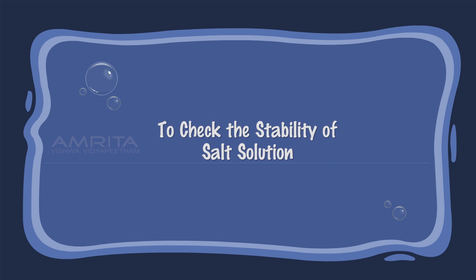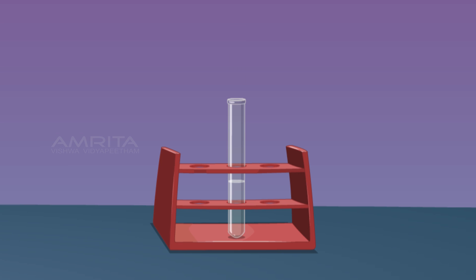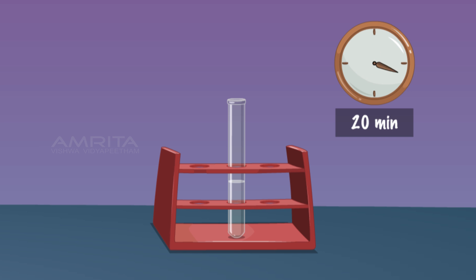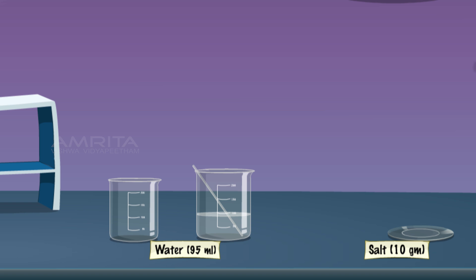To check the stability of the salt solution, take some salt solution in a test tube and leave it in the test tube rack for 20 minutes. The salt solution remains as it is without sediments. This indicates that true solutions are stable and do not show component deposits.